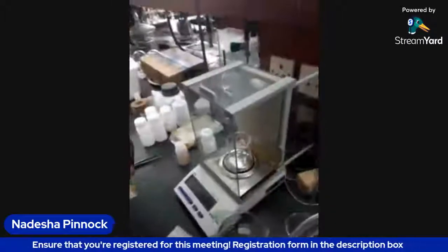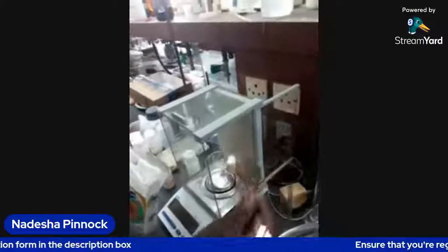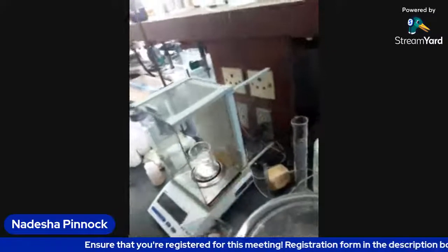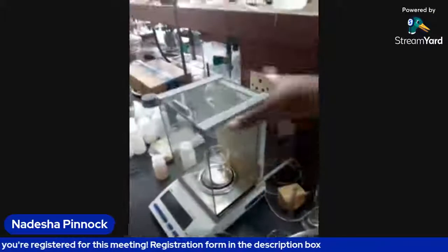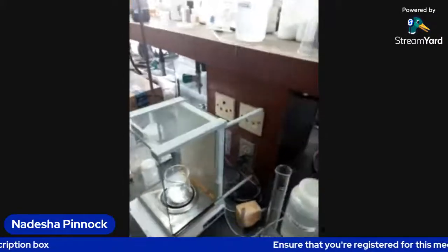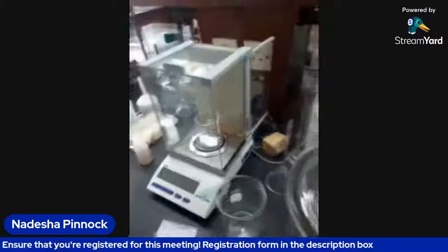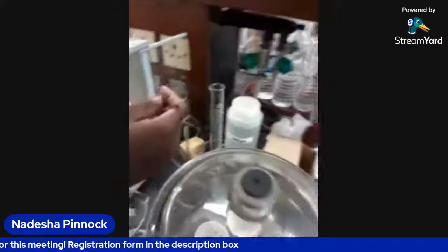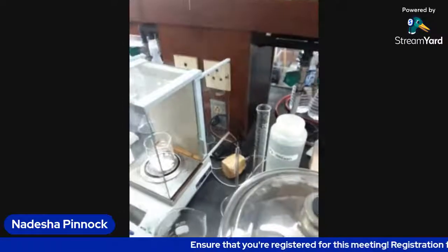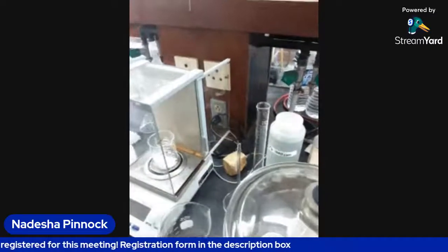That's 2.5 approximately. And you find that an analytical balance is a lot more accurate than a top-loading balance. A top-loading balance usually doesn't have this part to it, and it usually gives you your weights to two decimal places, as opposed to an analytical balance, which gives you the mass to four decimal places. So it's a lot more accurate. So we're at about 7 grams, and we're aiming for 10 grams.